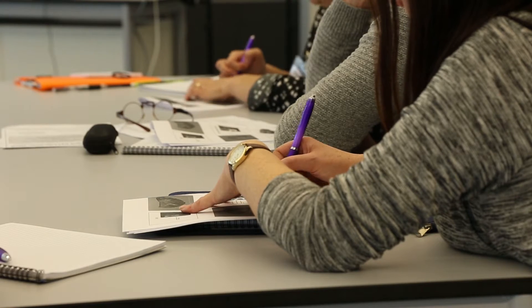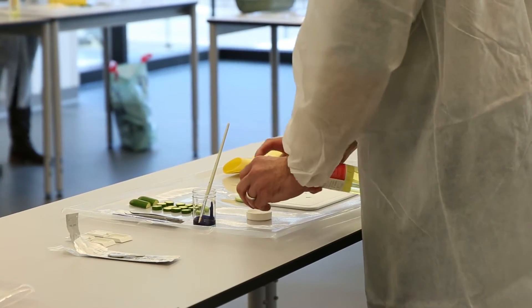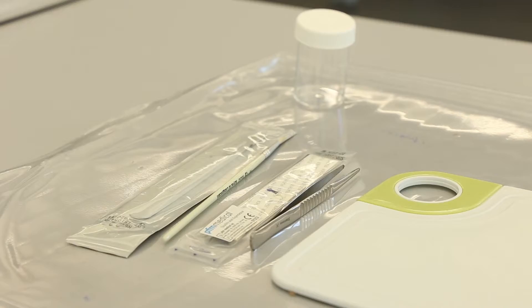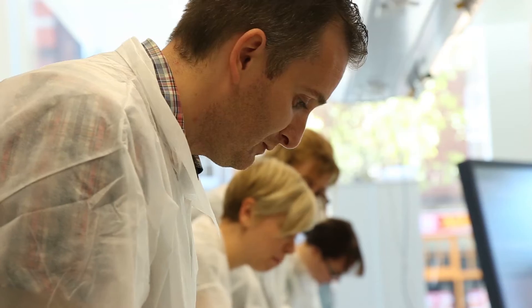The course is a mixture of theory and practical, to learn the basic techniques needed for specimen dissection. You can attend either a couple of days of the course just to do the theory, or the whole course where you learn all the different areas of the body and the dissection techniques.